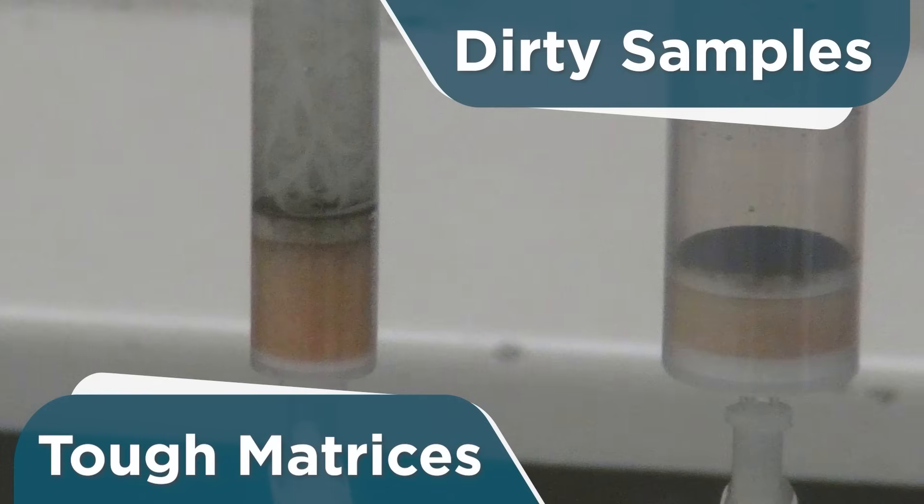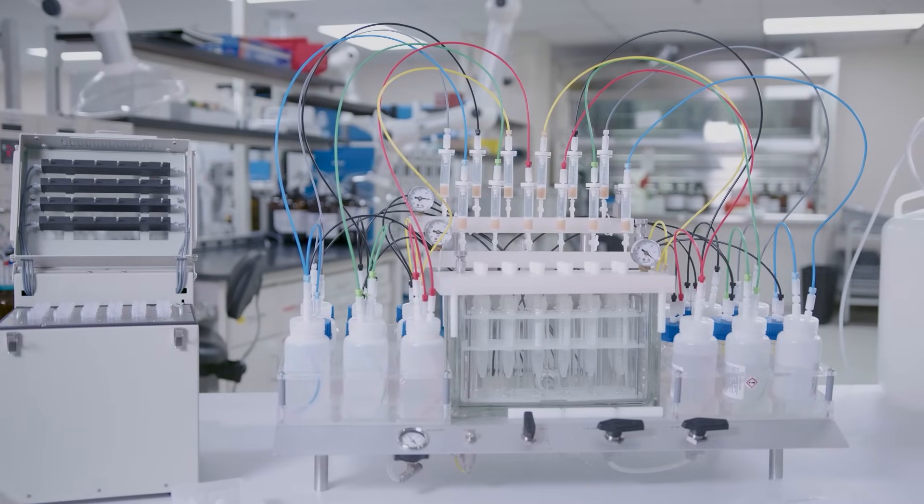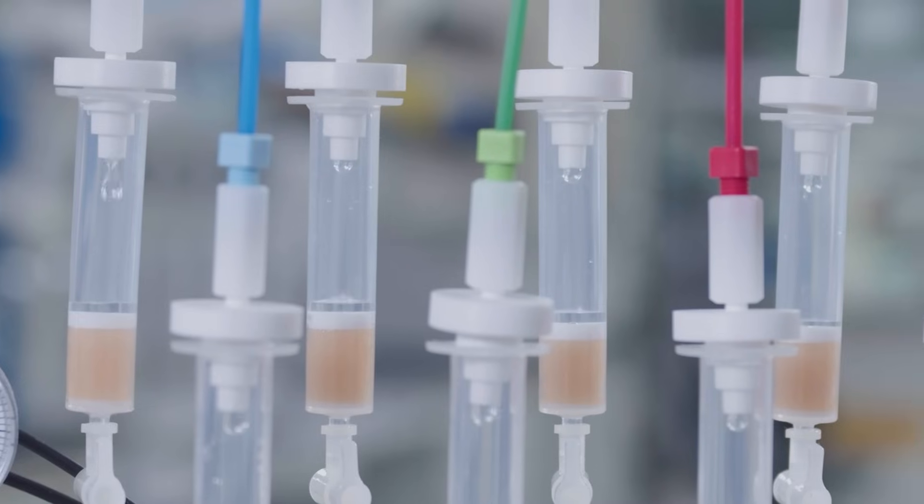It can easily handle tough matrices. The EZPFC has been implemented in many governmental agencies and commercial laboratories for PFAS.